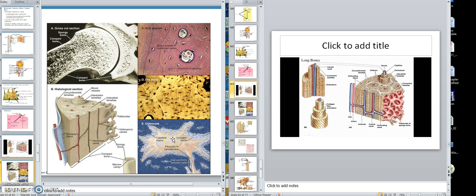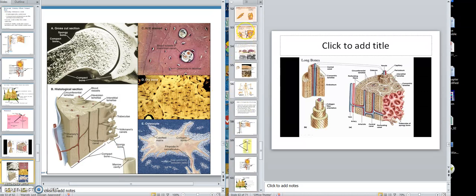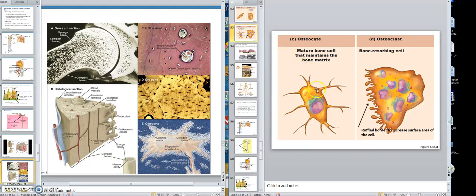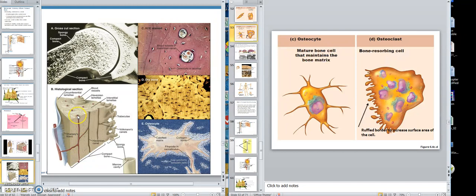Now the osteocyte, if you recall, had these appendages. When it slimmed down, it had these appendages. We need to hook one osteocyte to another osteocyte by gap junction so that oxygen and food can go in. So when you come here, this blood vessel here would deliver oxygen and food, because here's that central canal. Coming off the central canal, here's a blood vessel.